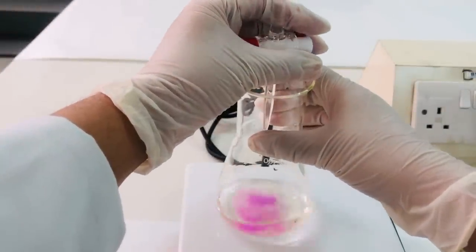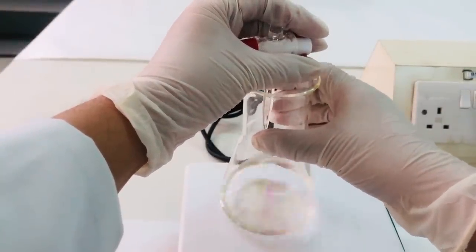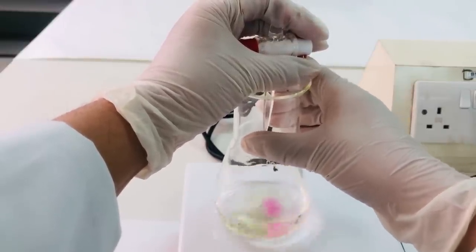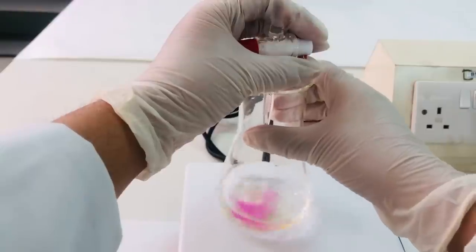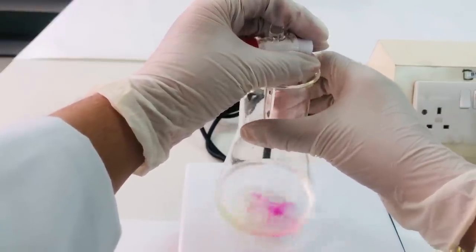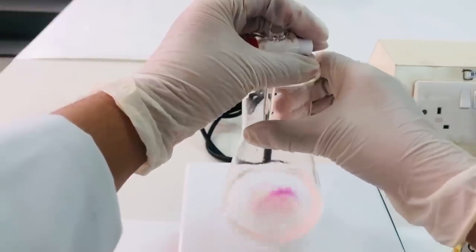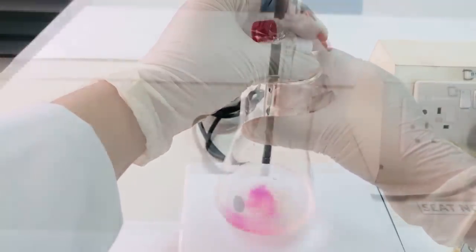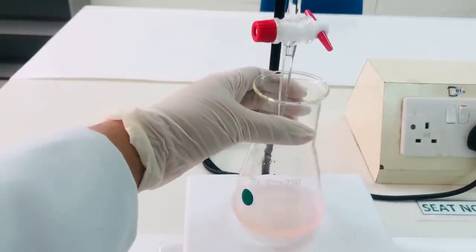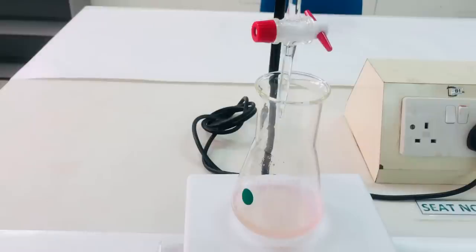Add the standard alkali solution to the conical flask and keep it shaking gently till a pale pink color appears. At the end point, a faint pink color will appear that will show the end point of the titration. What you should notice is that the pink color should remain for 30 seconds or more.